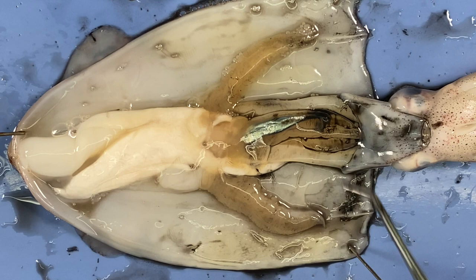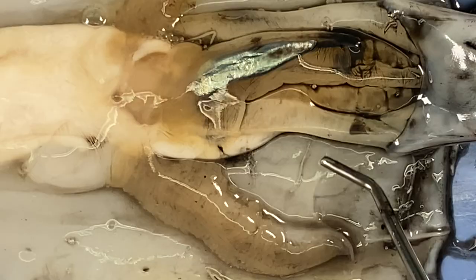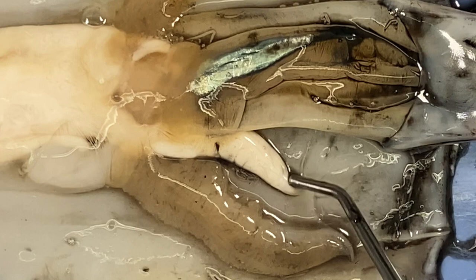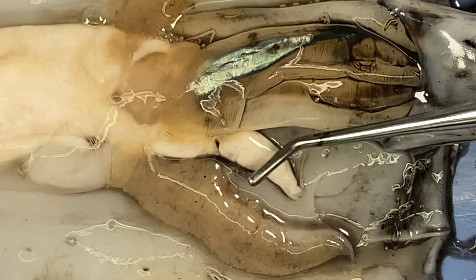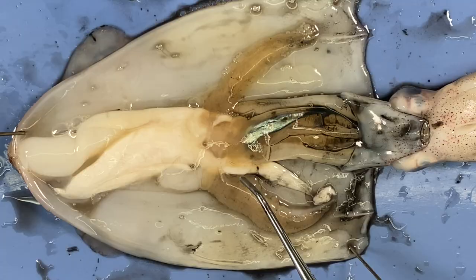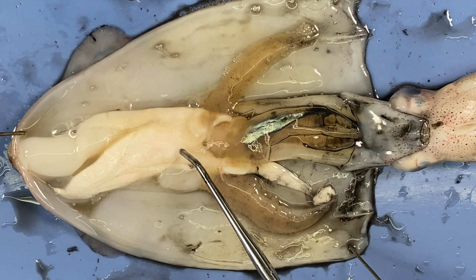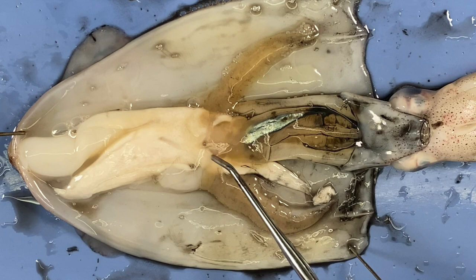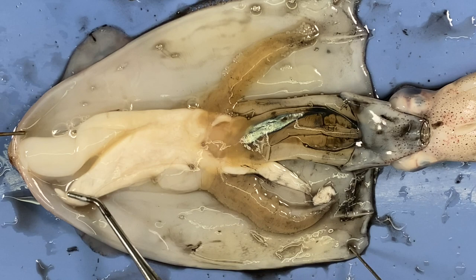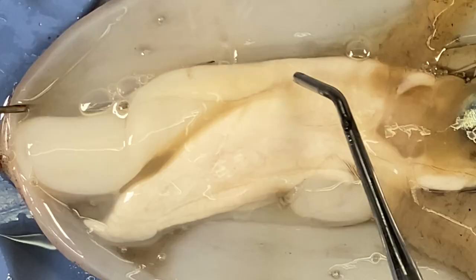Now let's look at some organs involved in reproduction. This is a boy — I can tell because that's the penis. If I tease this, you can see sperm come out — that milky substance is semen with sperm inside. I can follow that color back, and all of this whitish structure is reproductive tissue — these are the testes. It sometimes varies in size and shape and whether they're in reproductive mode, but this is the male reproductive system.